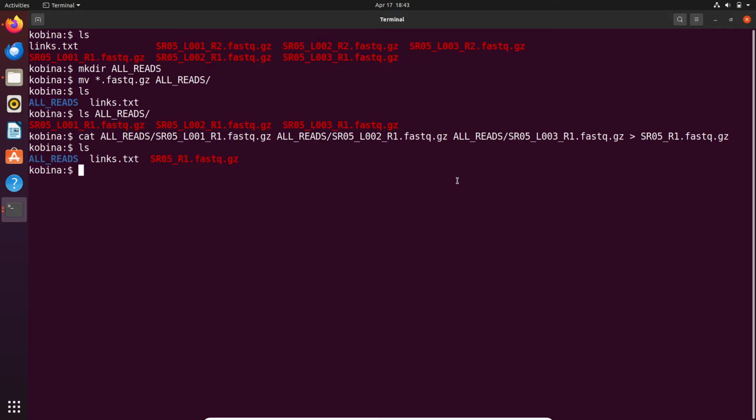But Linux makes it possible to do something simple. I'm going to show you how to do this in a much more refined manner, where we merge without having to specify all these things. Again, I'm going to first remove what we did, and then we are going to use that approach, which is very simple. You are going to love this approach.